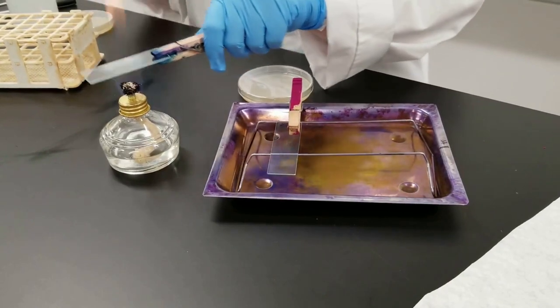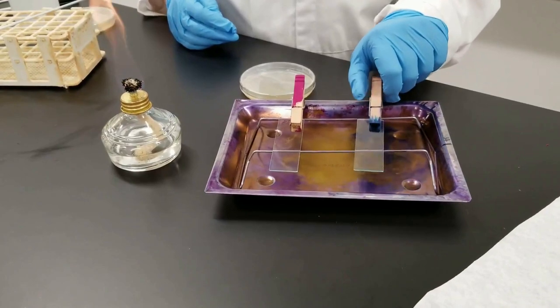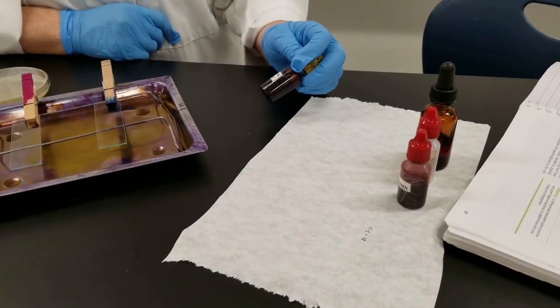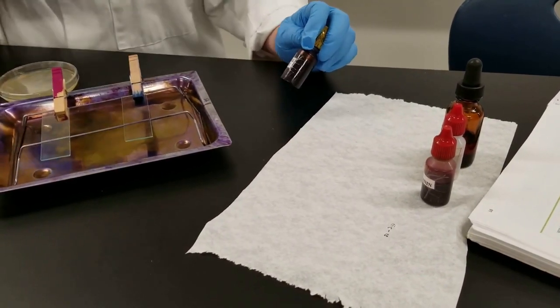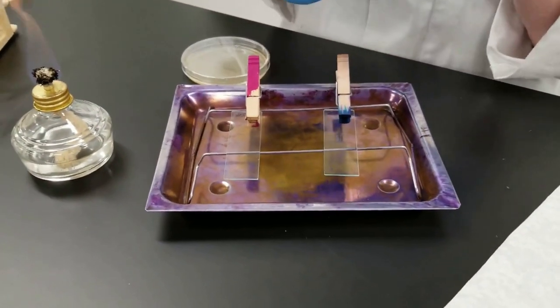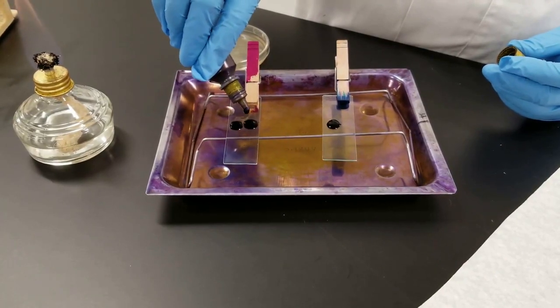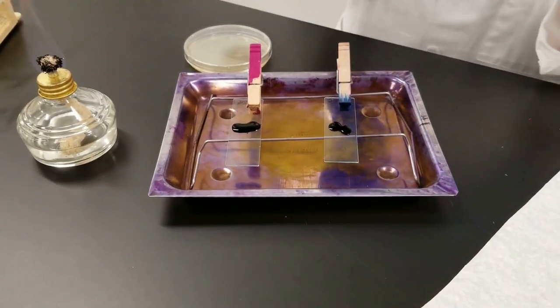And I'm now going to heat fix. Pass the slide through about three times. Now with the Gram stain, there's four different steps to this. The first step, we are adding crystal violet. We need to keep track of the time. I'm going to do both slides at the same time. Try to add a drop over the top of where you did your smear. You may need to add a couple drops on there and let that sit for 1 minute.